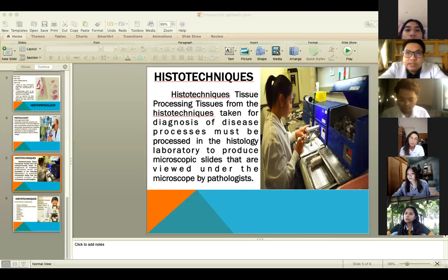Okay. Frozen section class is done by a pathologist. Okay? Hindi pwede ng medtech, hindi pwede ng nurses. Doctor, specifically pathologist. So, the surgeon class, they are going to operate on the patient sa OR. Tama? Okay. For example, breast mass. Okay? Breast mass.